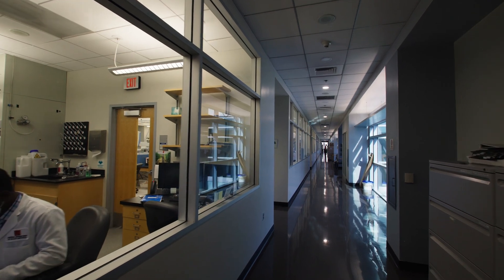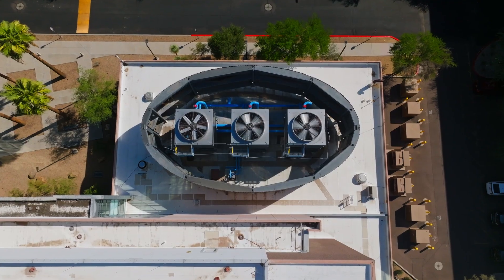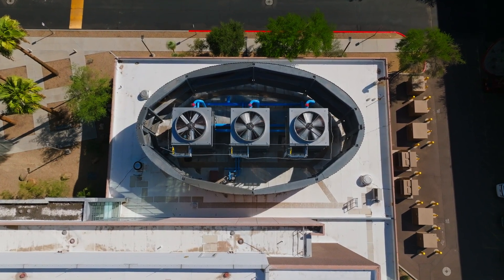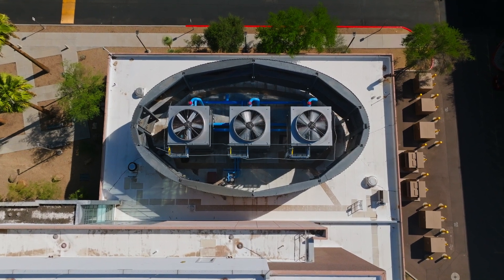HEPA filters clean the air coming into the laboratory, as well as the filtered air that is exhausted in a plume at least 500 feet high.